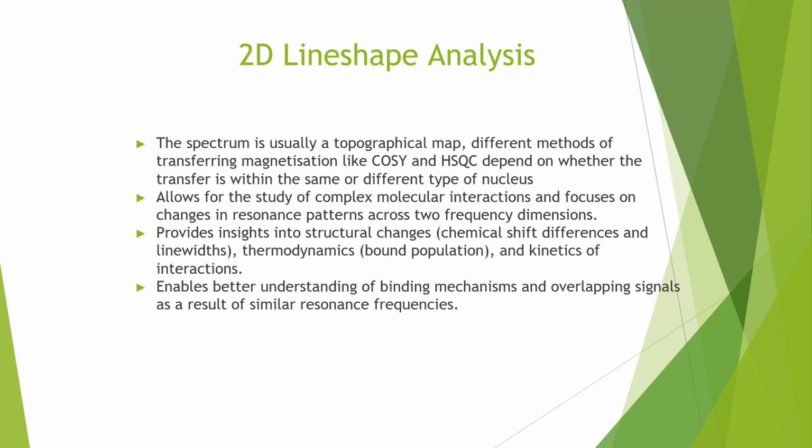Different methods of transferring magnetization, like COSY and HSQC, depend on whether the transfer is within the same or different type of nucleus. It provides valuable insights into biomolecular interactions by examining changes in resonance patterns across 2 dimensions, offering a comprehensive understanding of structural, thermodynamic, and kinetic aspects.